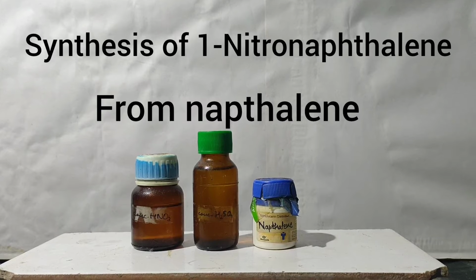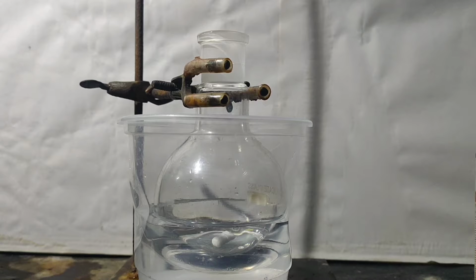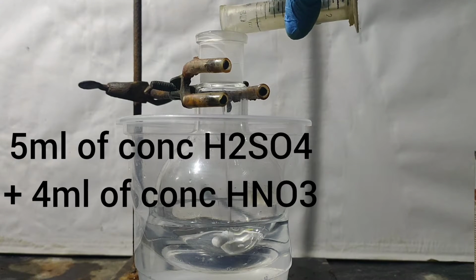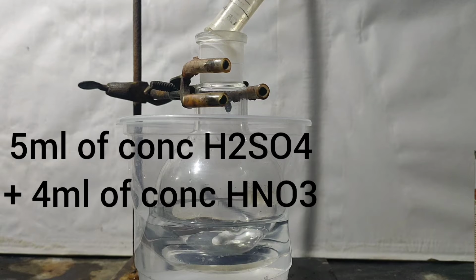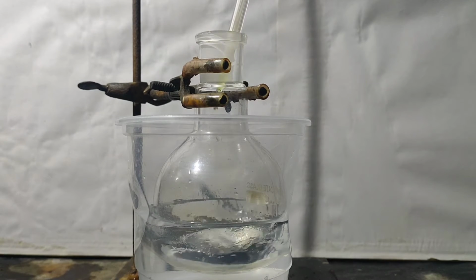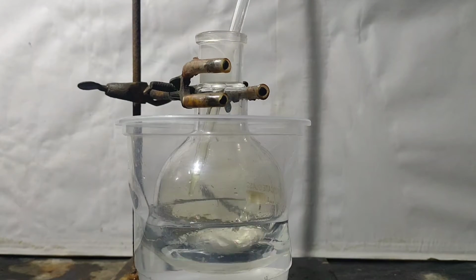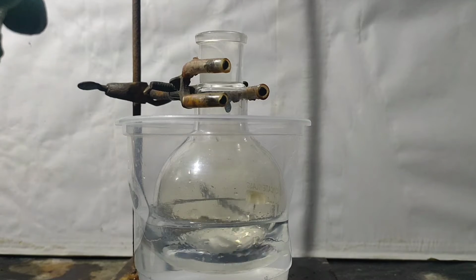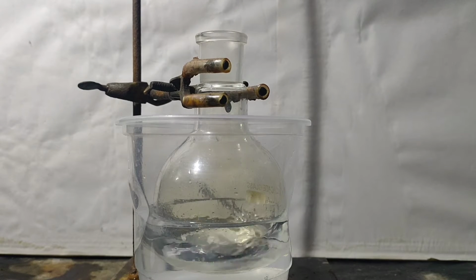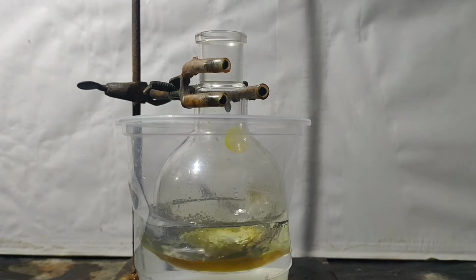So to start things off, I start with making alpha-nitronaphthalene from naphthalene. For that, I set up a flat bottom flask in a cold water bath with magnetic stirring. To it, I added 5 ml of concentrated sulfuric acid, then I added 4 ml of 70% concentrated nitric acid dropwise with stirring. Thus, the nitrating mixture was prepared. Now to this, 5 gram of powdered naphthalene was added in small portions.